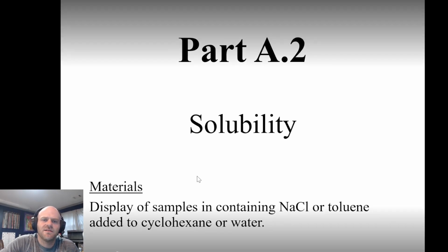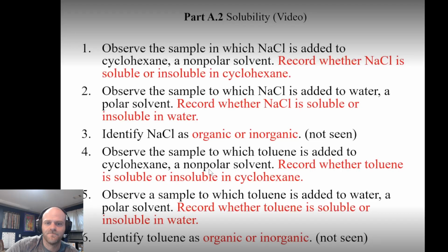All right, so solubility. Solubility is when something dissolves into solution. And so we're going to look at samples containing sodium chloride, table salt, or toluene when you add it to cyclohexane and water, or vice versa. I'll give you a second. I can go over this.